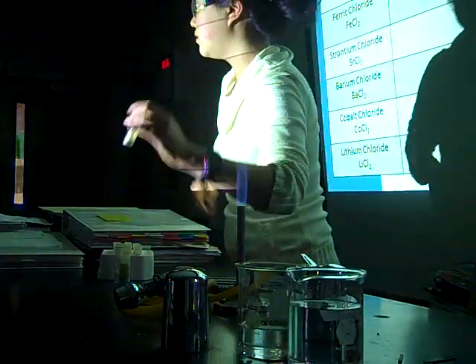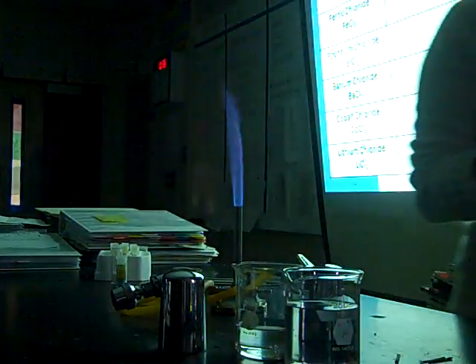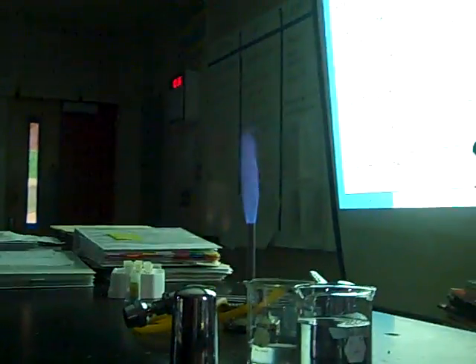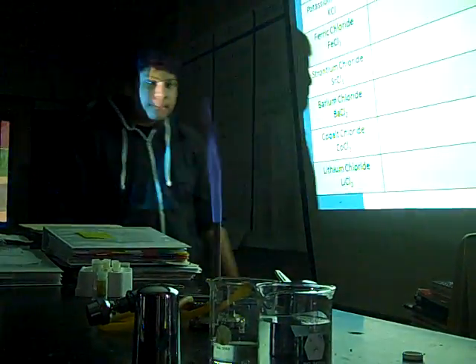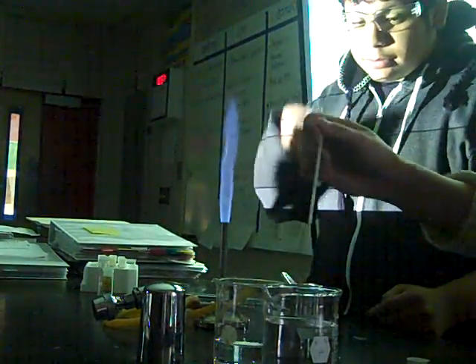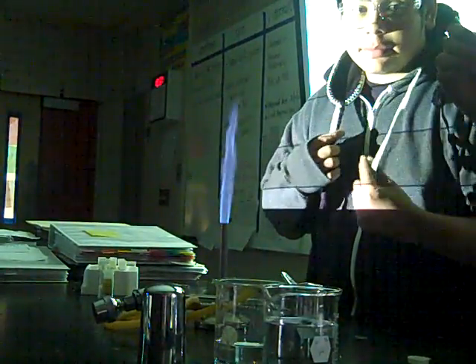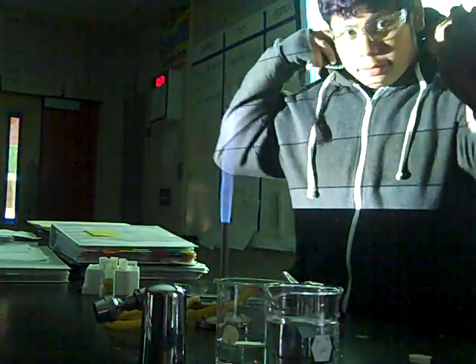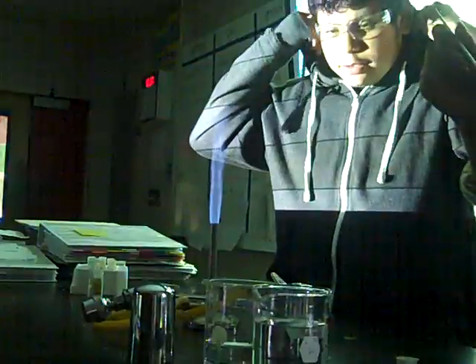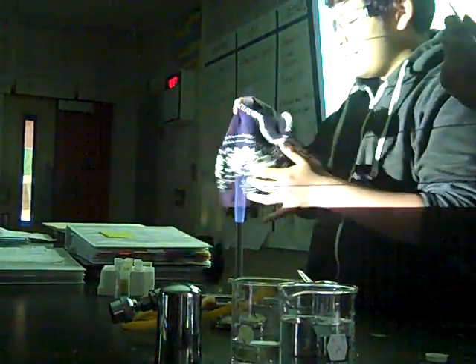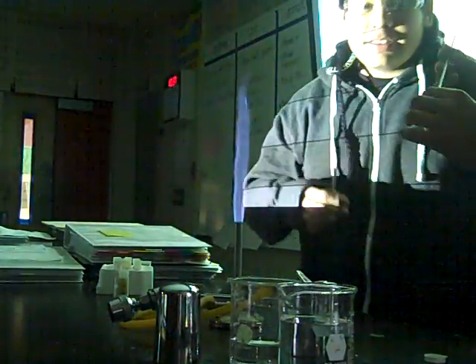Come on, come on up. You! Alright, safety goggles. Alright, so this is just regular table salt. NaCl. Sodium fluoride. I want to do something cool. They're all cool. Here. All of them.